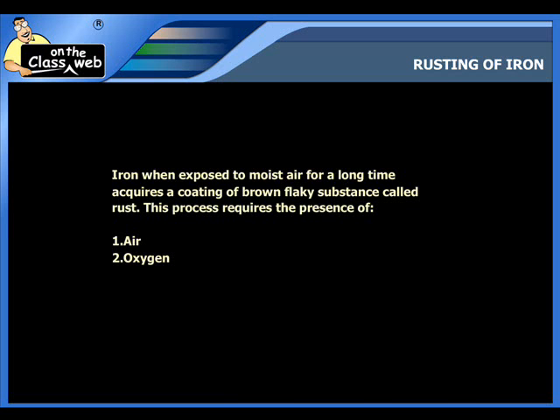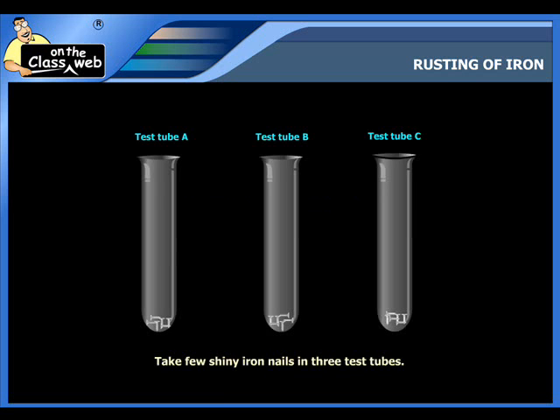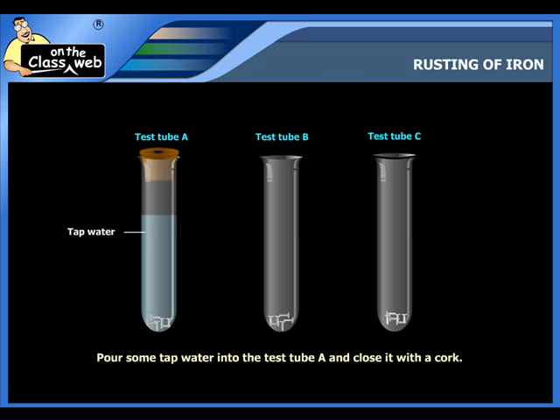Let's see how rusting of iron happens. Take few shiny iron nails in three test tubes and label them as A, B and C respectively. Pour some tap water into the test tube A and close it with a cork.